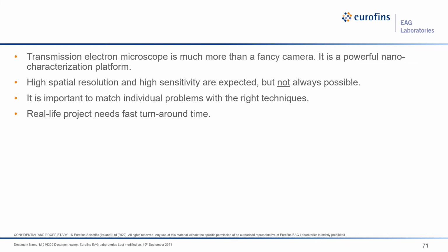Also, with TEM there are so many different types of techniques, so it's going to be very important to match your problem with the right technique. I don't want to match my technique with your problem; I want to match my technique to your problem, to solve your problem. Whenever I have a new request, I will always ask, what is your problem? And then we'll design a TEM application for your specific material.